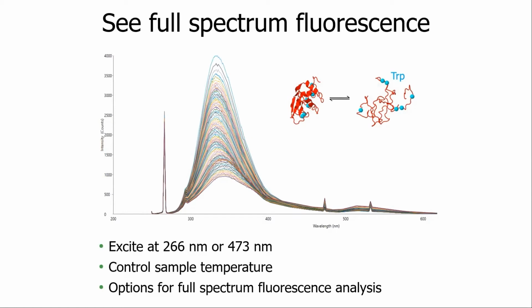On this graph, you can also see a prominent peak at 266 nanometers. The area under the curve for that peak is the SLS signal from the UV laser as it hits particles present in the sample and bounces back out. The short wavelength of that SLS laser makes it an incredibly sensitive technique for detecting when aggregate formation begins. It will detect changes in molecular weight well before they begin to demonstrate a size change by DLS.